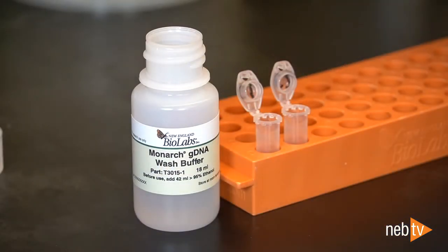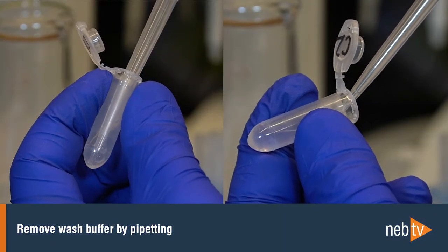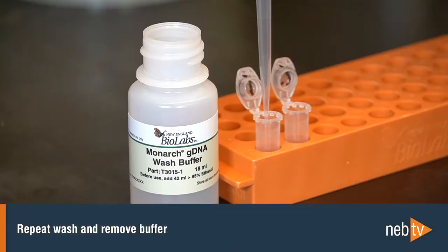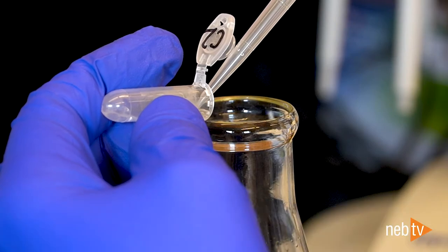Add 500 microliters of gDNA wash buffer, close the cap, and mix by inverting two to three times. Then remove the wash buffer by pipetting using one of the methods just described. Repeat this wash step and once again remove the buffer. This time you can pour the buffer out, using the pipette tip to ensure that the beads stay in the tube.